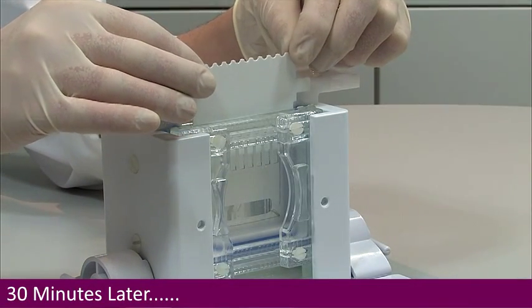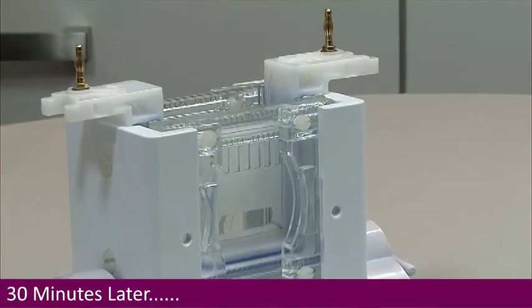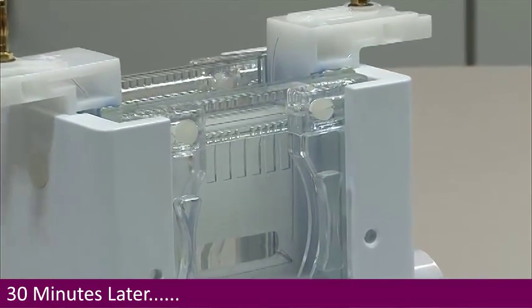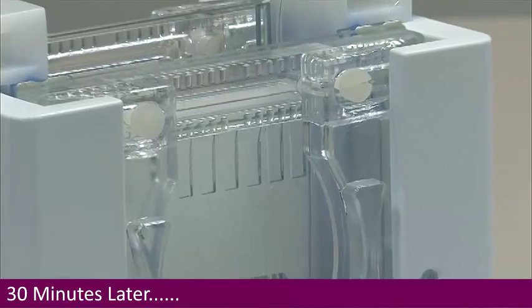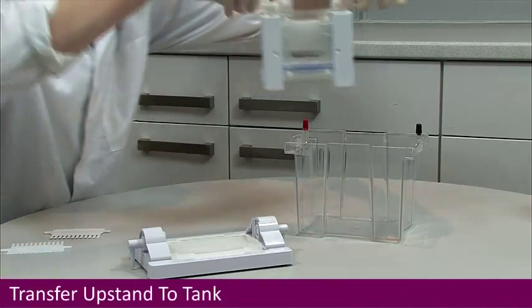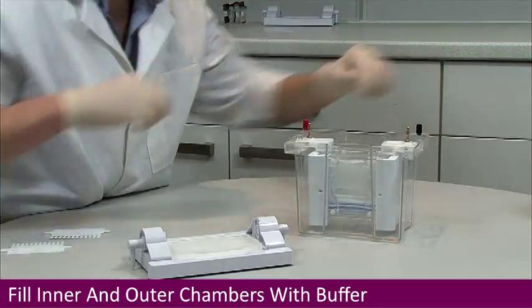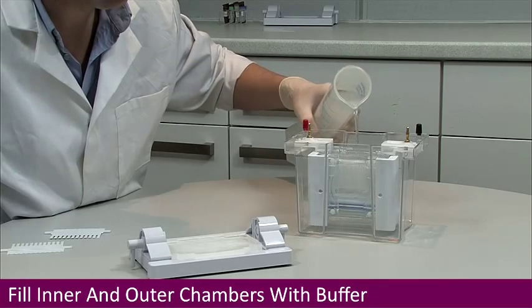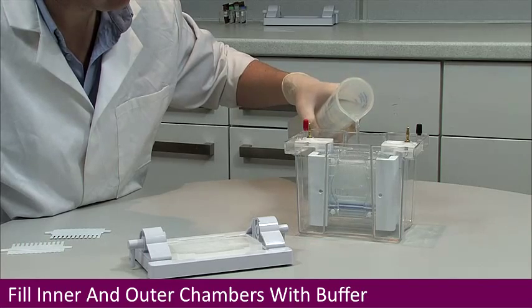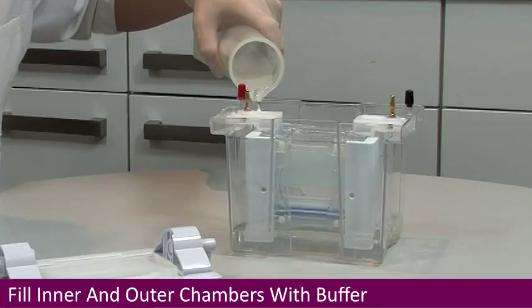Remove the combs from the polymerised gels. Transfer the upstand to the tank and fill the inner chamber with just enough buffer to cover the notch of the inner glass plates and to fill the comb wells. Fill the outer tank as well, covering the bottom of each gel cassette.